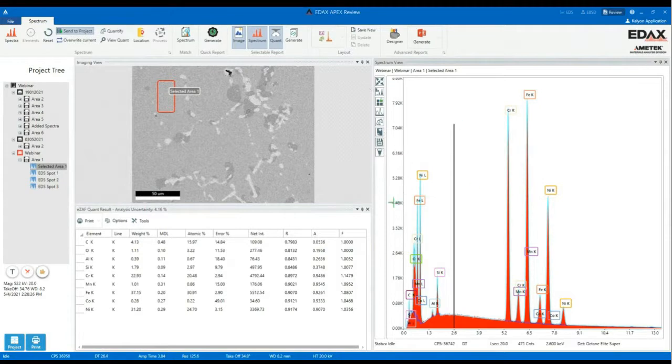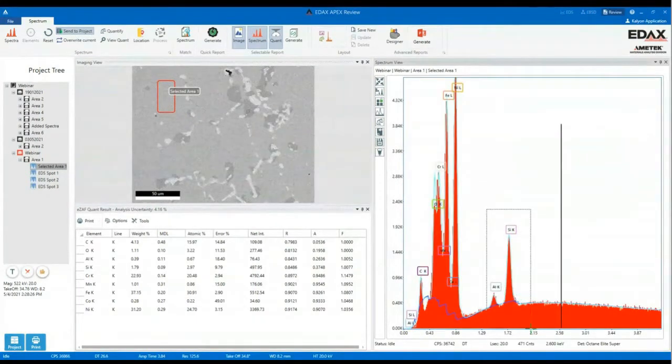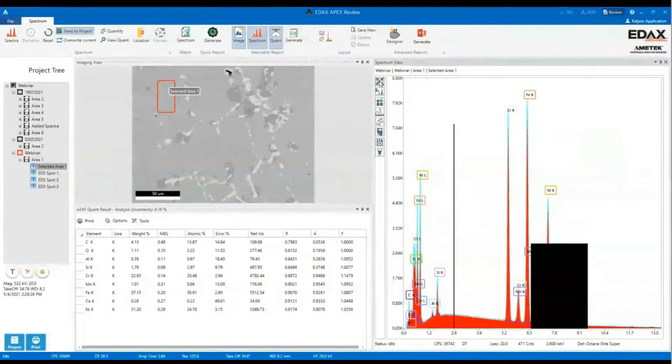So we also have some options on the left in the spectrum view. When you maximize, for example, one peak by hold and right-clicking, and you want to go to the home view, you click on the first box. And when you want to customize the scaling, you can go to manual and type in how the scaling should be, because the software is doing this automatically, but you can also customize the view of the spectrum.